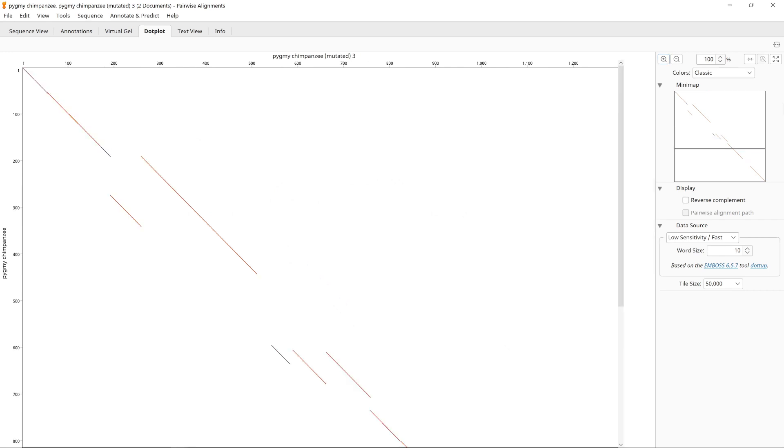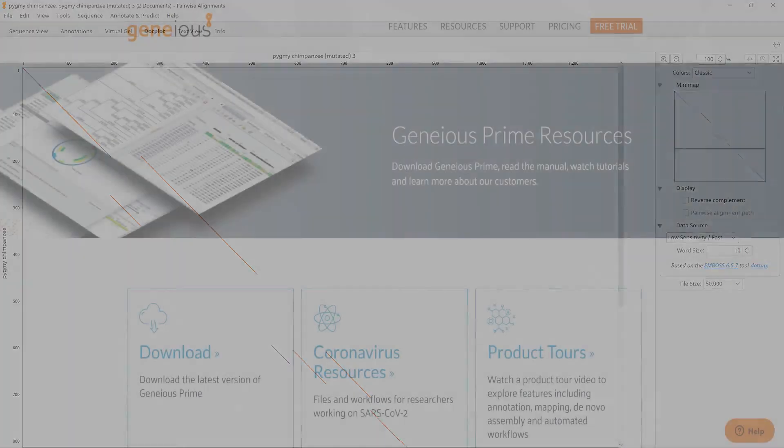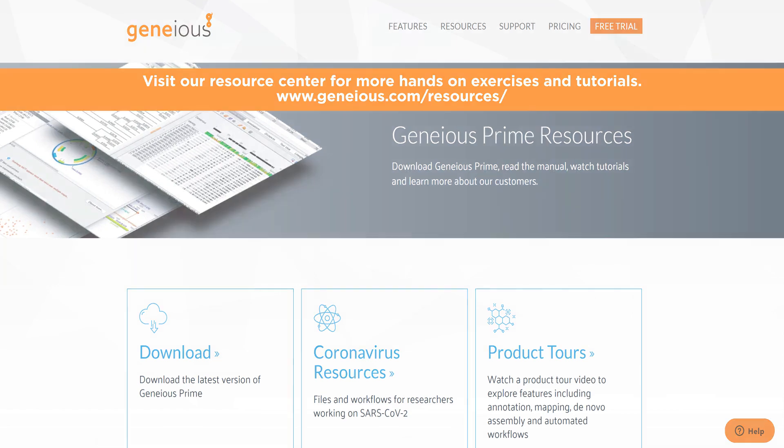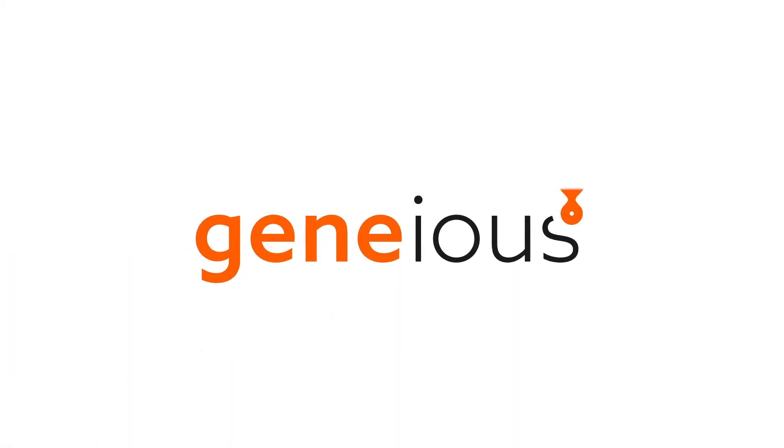Dot plots allow you to become familiar with how two sequences are related before you move on and start aligning them. Visit our Resource Centre for more hands-on exercises and tutorials.